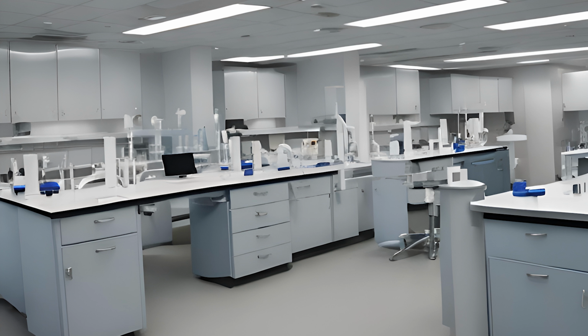They can enter your clinical lab unannounced, and as long as they present their credentials proving that they are from OSHA, they can inspect your lab. OSHA is not going to come in and inspect how you are doing science. OSHA is going to come in and inspect whether or not you are doing science safely. They are not meant to be the technical experts on the process of running an RPR or how to detect glucose in somebody's blood. They're there to make sure that you're not exposing people to that blood and putting them at risk of a bloodborne pathogen exposure.